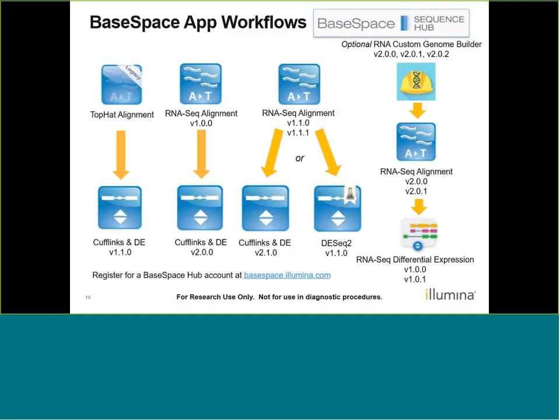Also, I just want to put in a quick note that these particular workflows are going to be best suited for libraries that are prepared using TruSeq RNA-V2, TruSeq Total RNA, TruSeq Stranded mRNA, TruSeq RNA Access, and TruSight RNA Pan-Cancer.